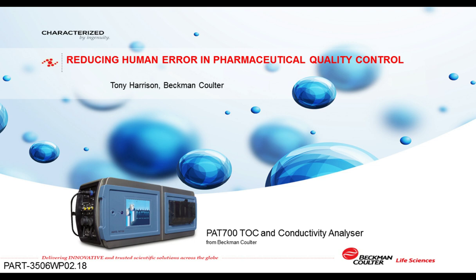The first question is, how can the PAT 700 TOC analyzer from Beckman Coulter be validated to support its use for product release testing? Yes, good question. In fact, in the ICH-Q2 document, the tripartite committee from the United States Pharmacopoeia, European Pharmacopoeia, and the Japanese Pharmacopoeia lay down the guidance on how an analytical method should be validated to demonstrate that it's suitable for its intended purpose. I have a paper on validating the PAT 700 TOC analyzer to ICH-Q2, and I'll send it out to you.